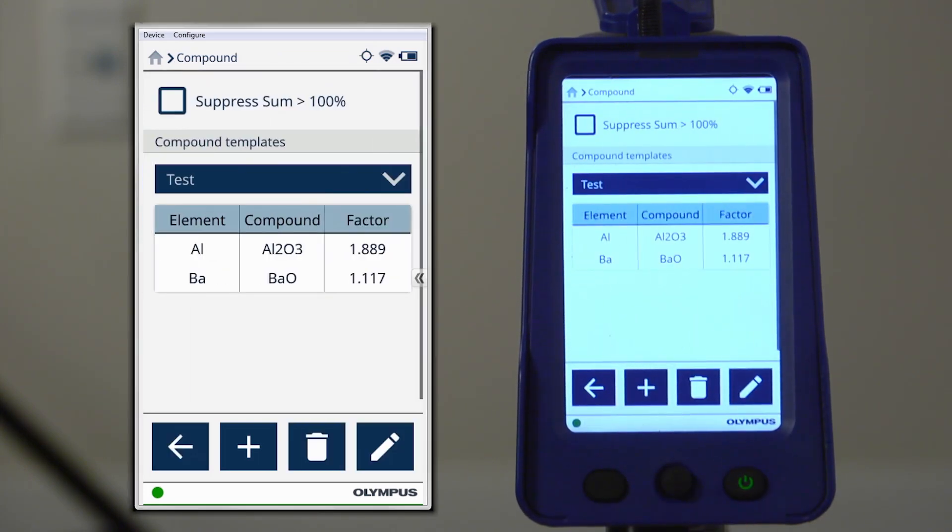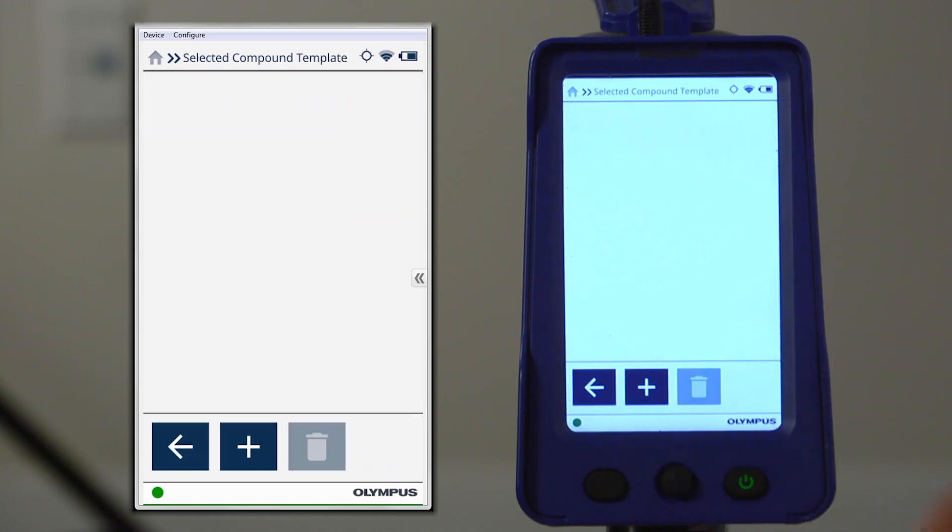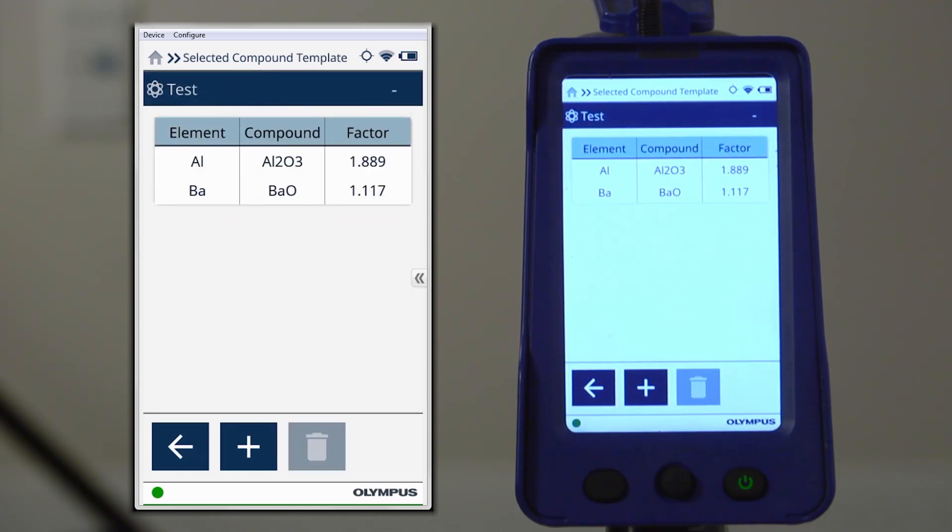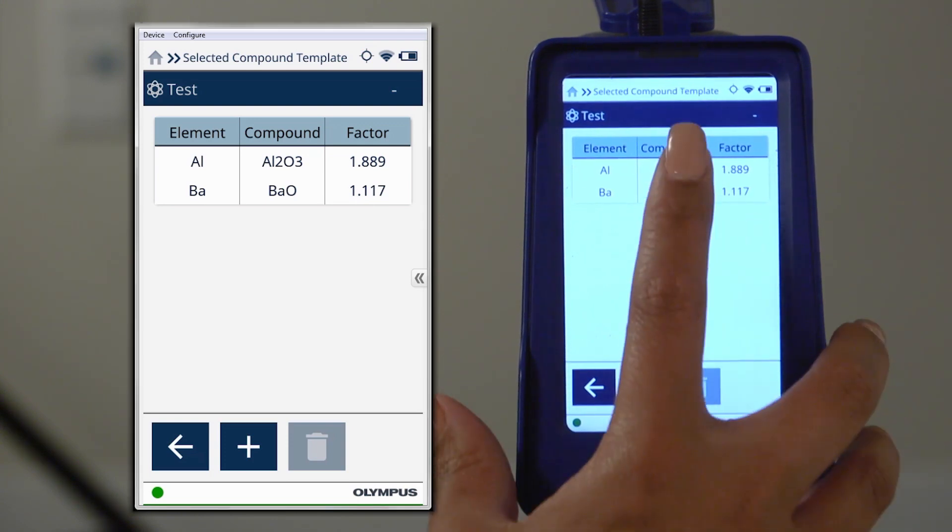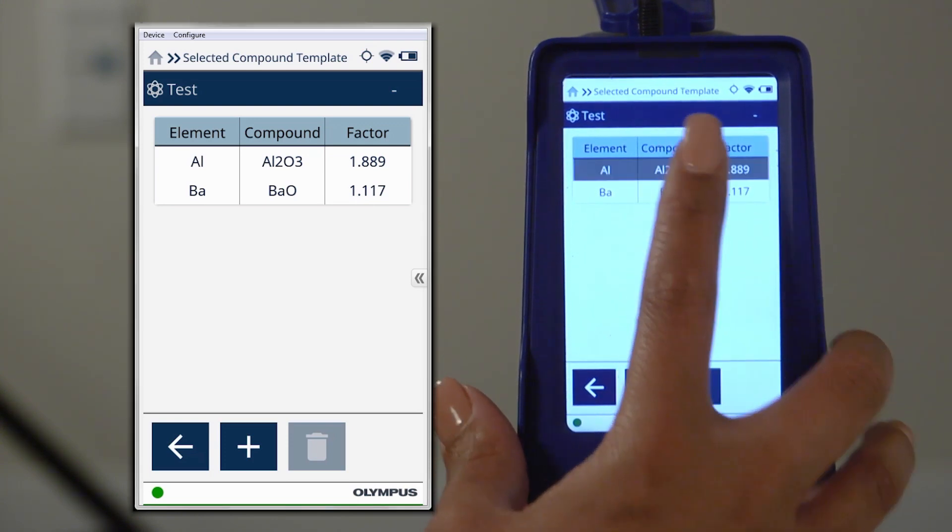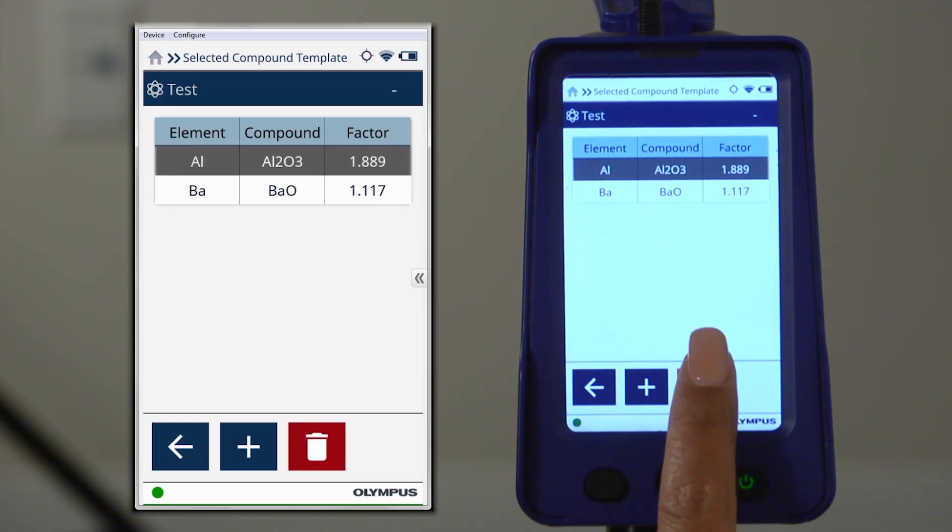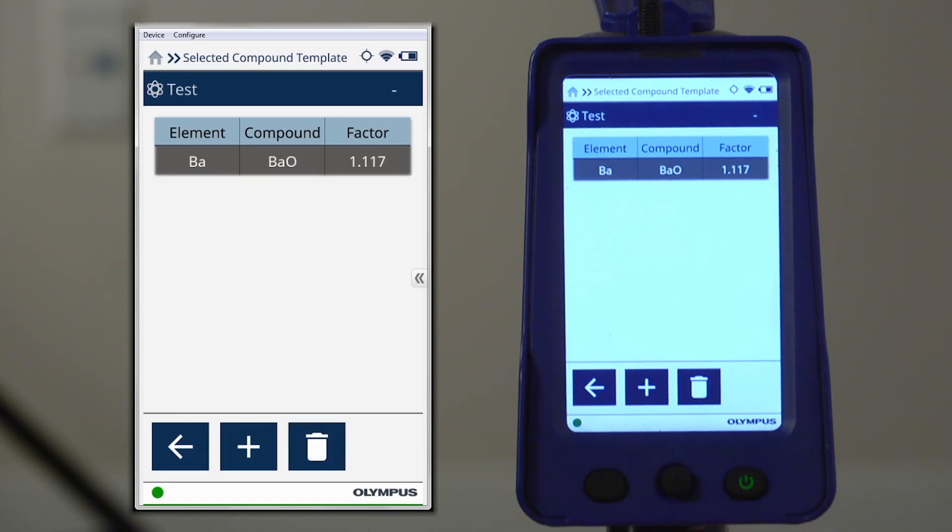To add or remove a compound from the template, select the pencil icon. As before, select the plus icon to add compounds. And to remove a compound, highlight the compound and double-tap the trash icon to remove it.